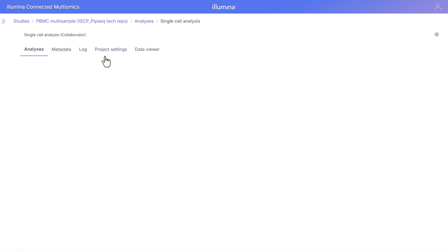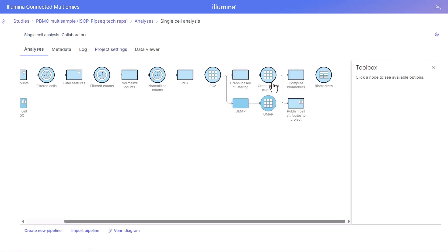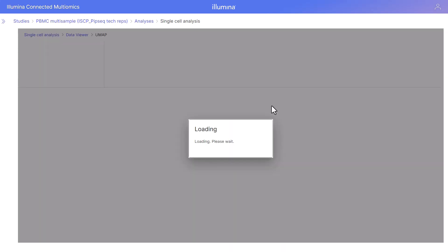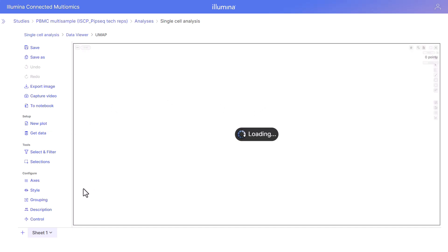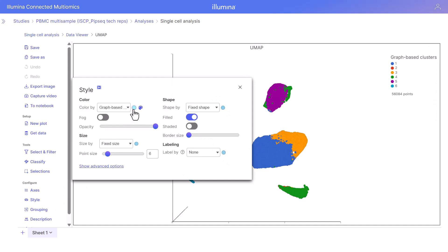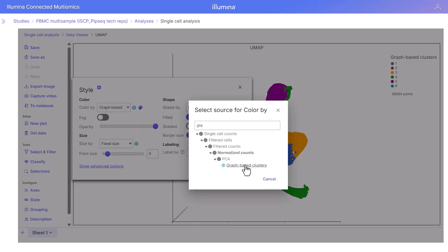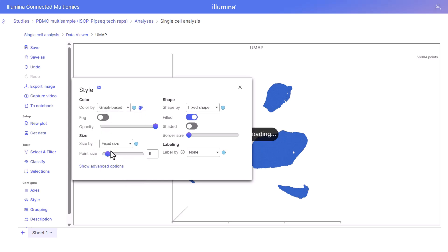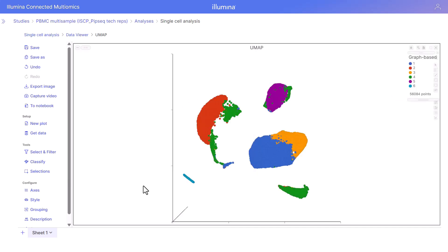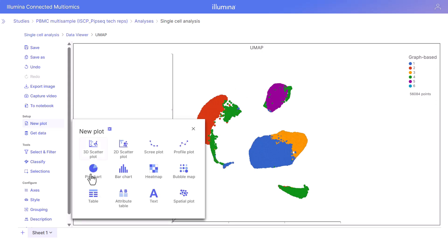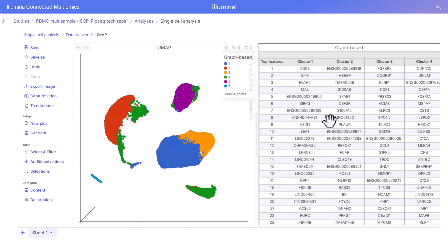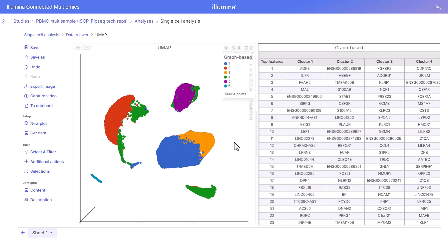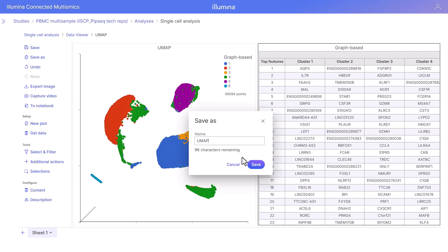Going back to the analysis tab, an alternative way to view the graph-based clusters on the UMAP is to open the UMAP by double-clicking. We're going to color by the graph-based clusters — navigate to style and select that graph-based clusters node from the drop-down. These are the graph-based clusters from the cell-level attribute we just published. We're also going to add a biomarkers table so we have gene expression for each of those clusters visualized on the UMAP. We can save this data viewer session and come back to make changes.